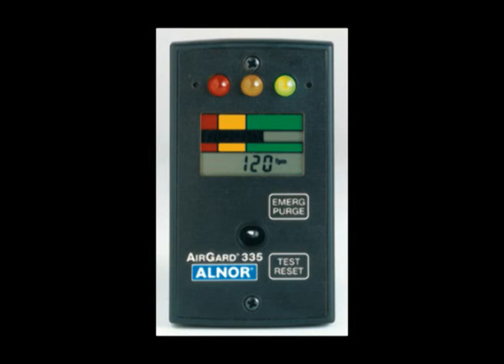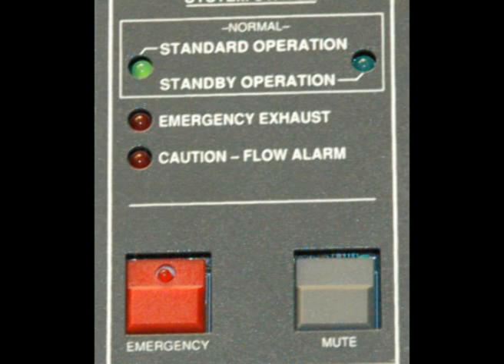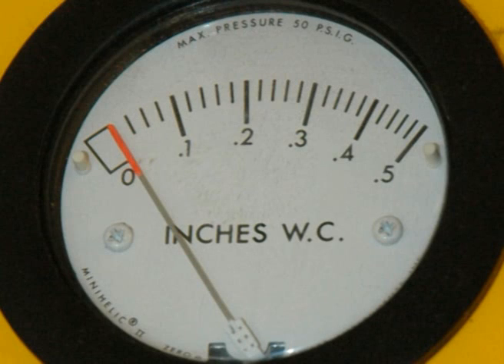Digital monitors display air velocity into the hood and should read more than 100 feet per minute. Some monitors will only display red, yellow, and green indicator lights. All monitors have an audible low flow alarm. Some fume hoods have differential pressure monitors that look like this. Since these monitors may be different from building to building, check with your supervisor for the correct meter reading. It should always be greater than 0.